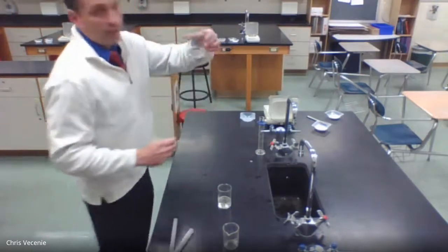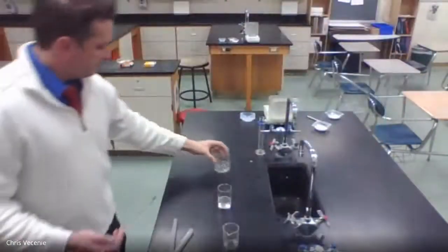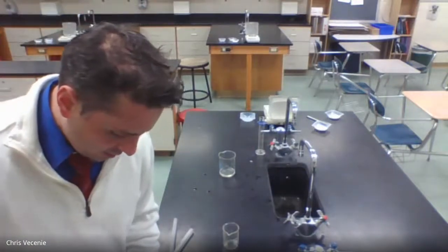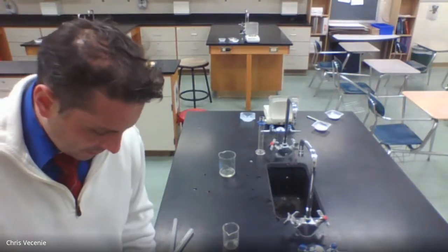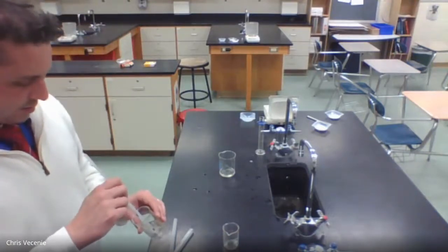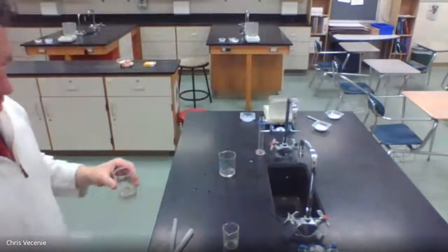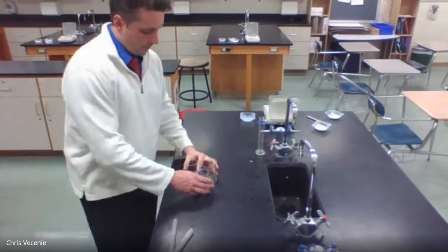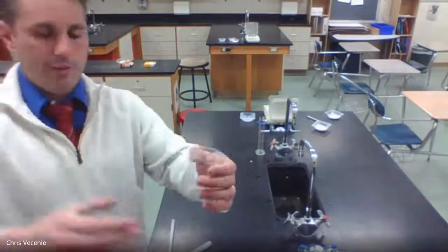All right, so if you take a look, here's my calcium chloride. Nice and dissolved. Still a little bit of solid there in my sodium compound. So got to stir just a little bit more here on my sodium compound. Take a look. There's my sodium carbonate dissolved. So what I'm going to do is take both of these and pour them into this 100 ml beaker.